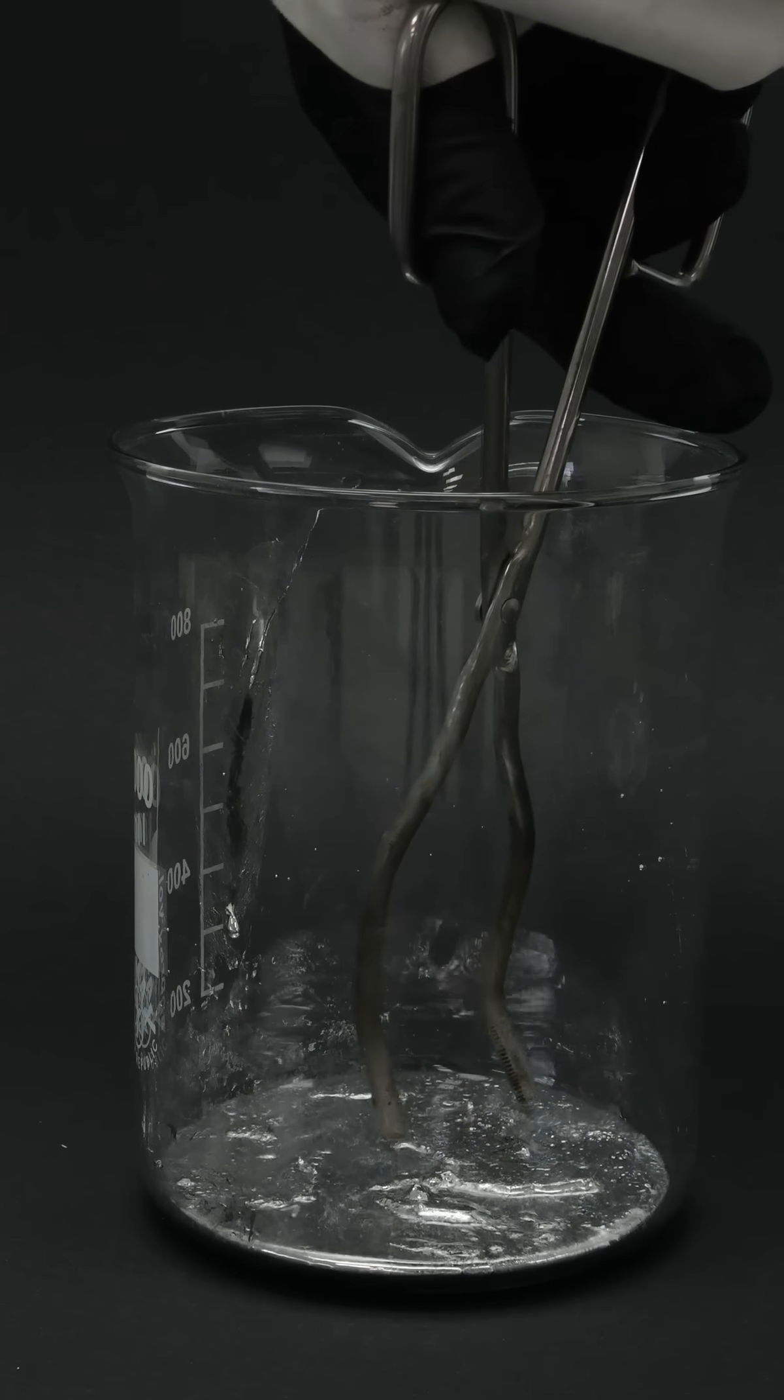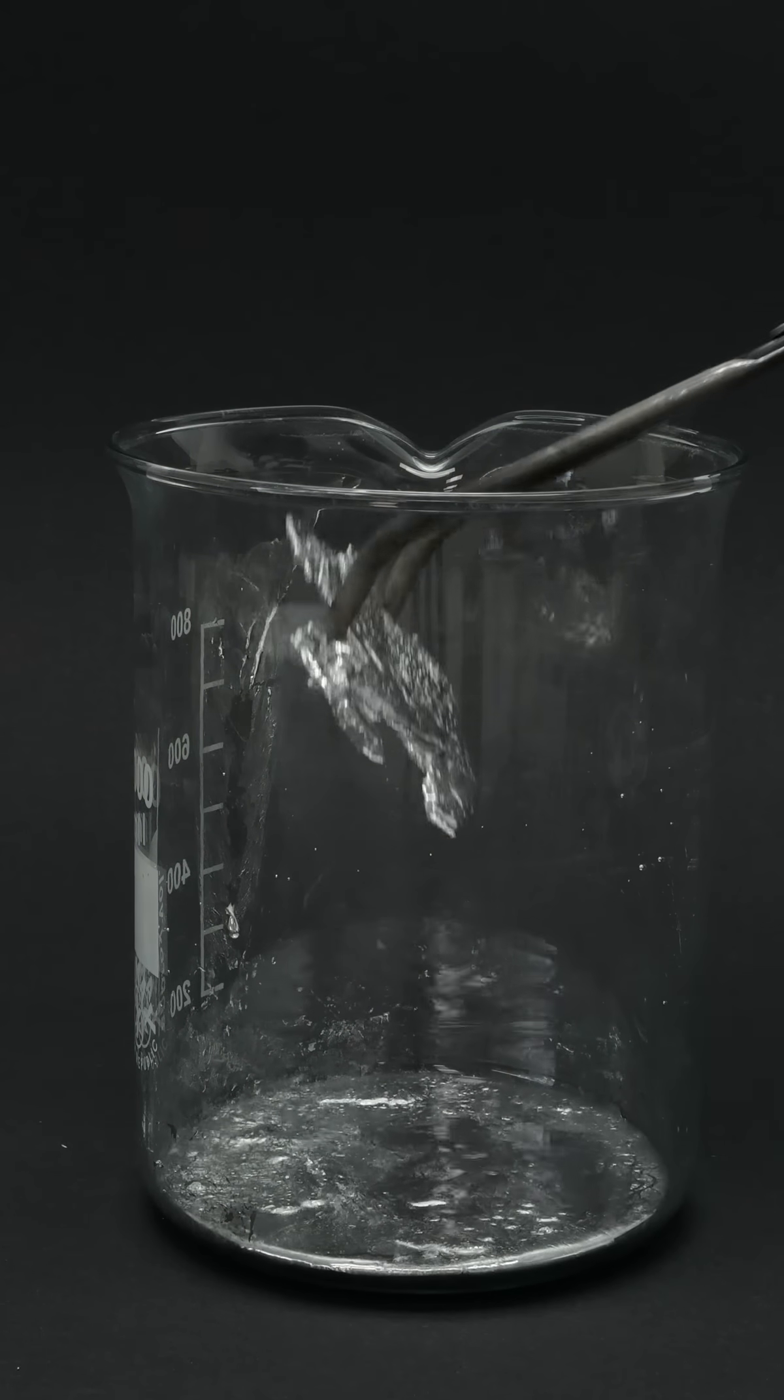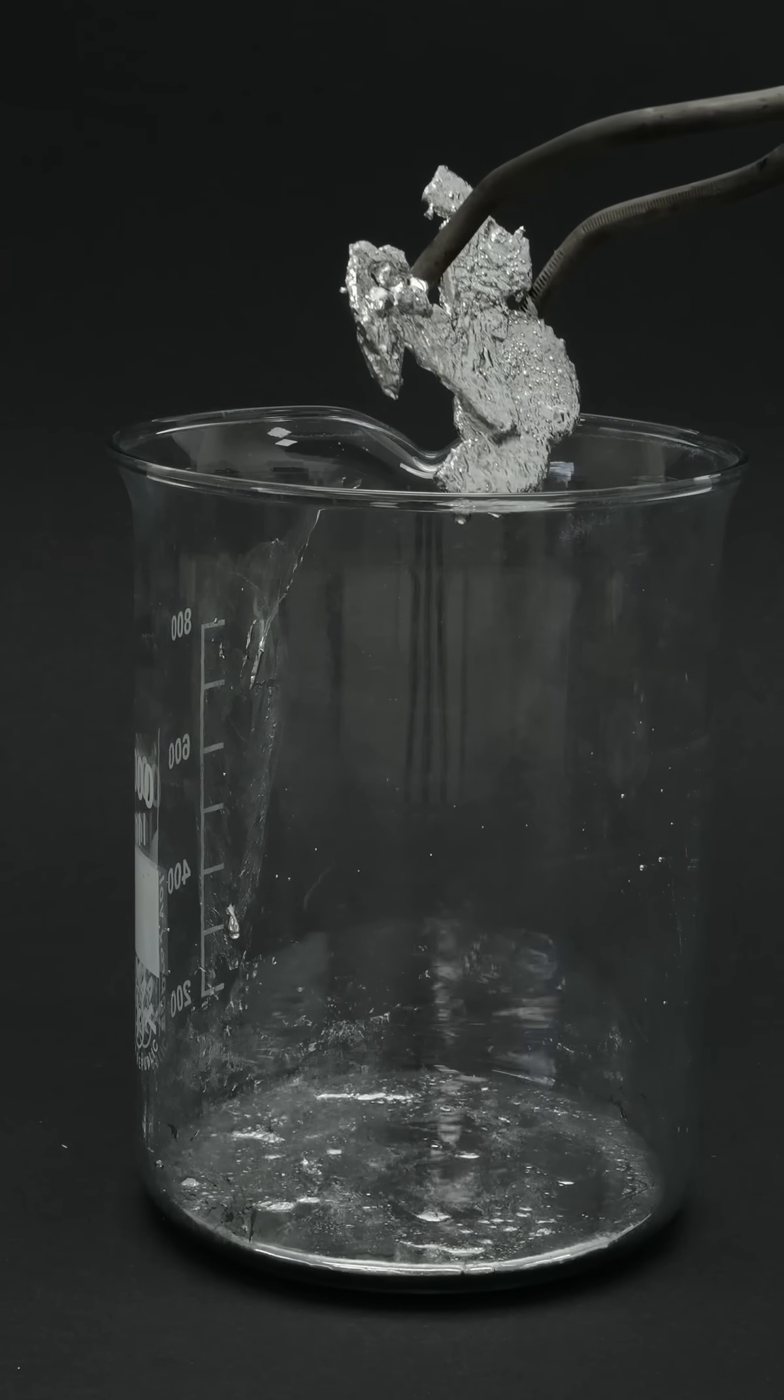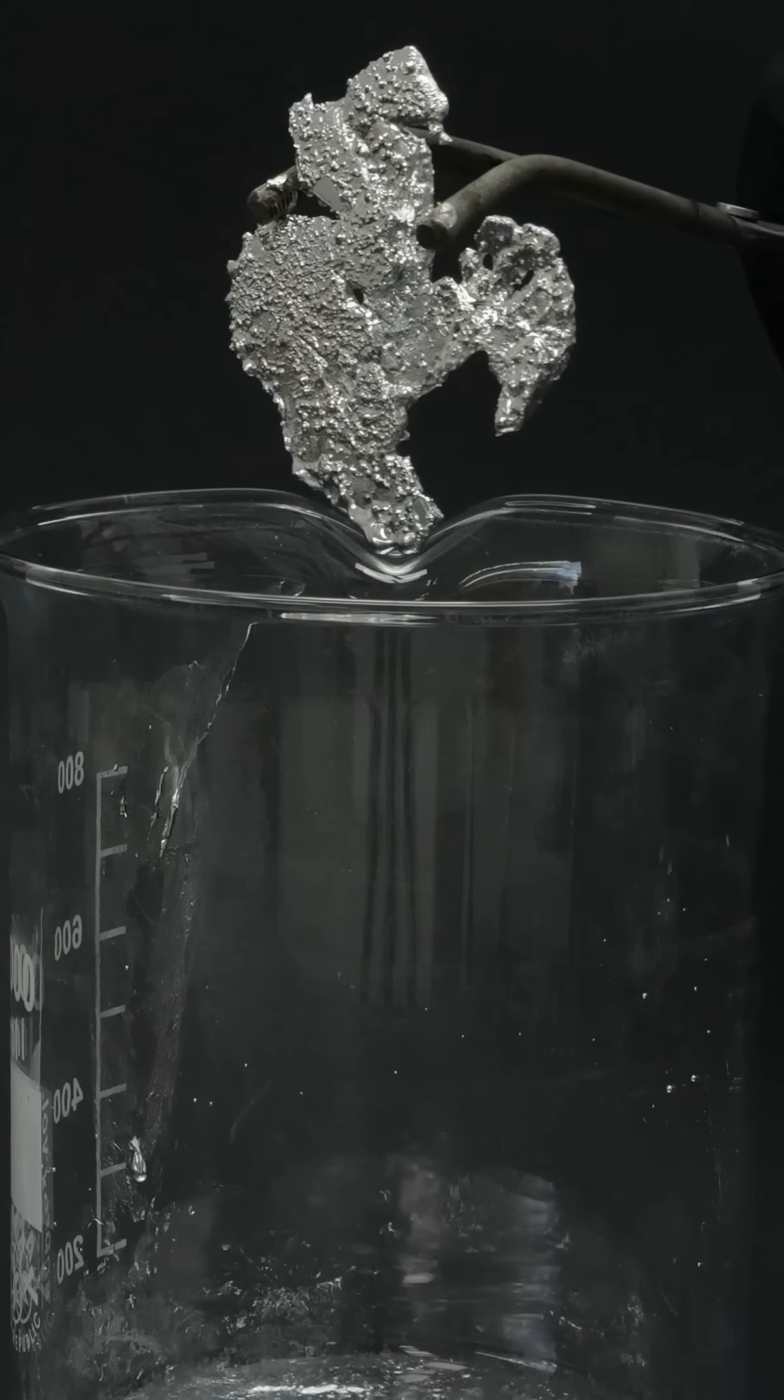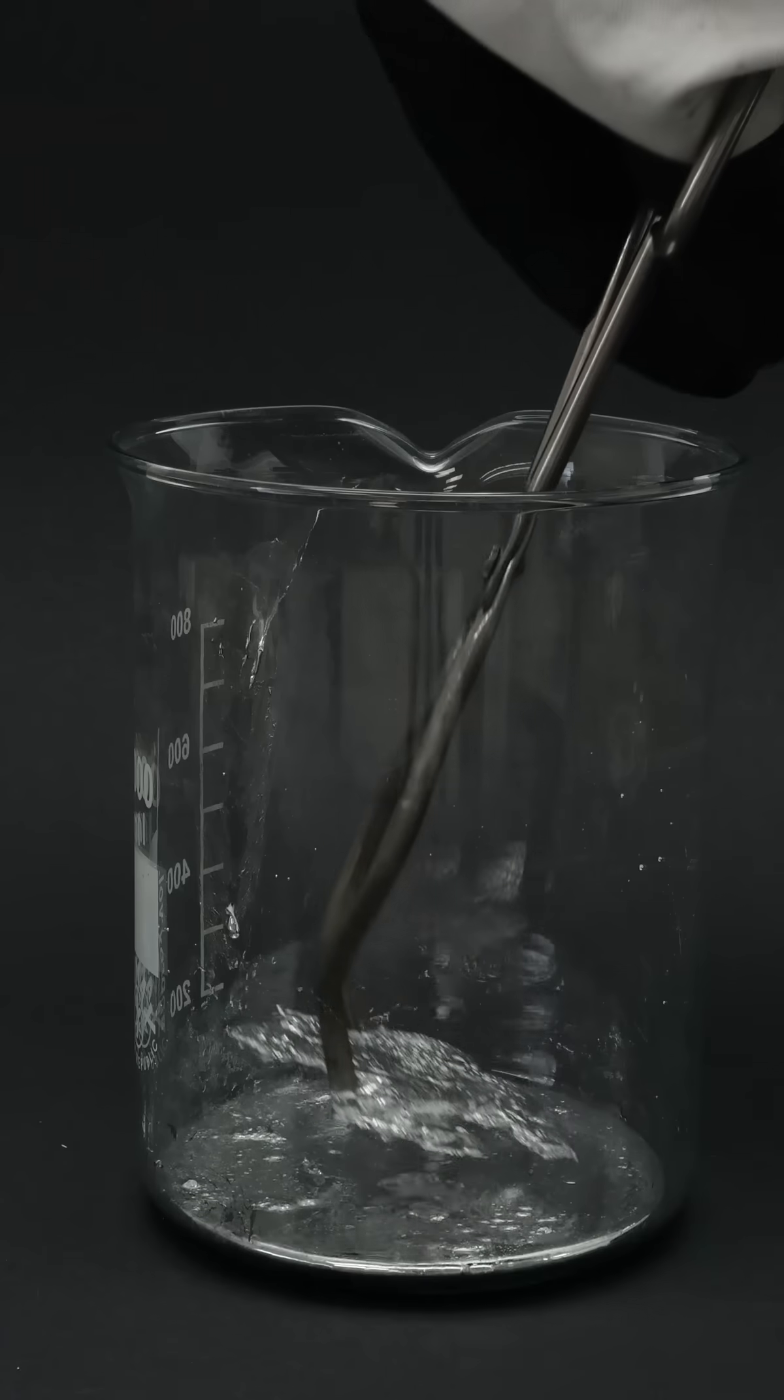When pouring it into a beaker, it's noticeable that part of the gallium has solidified again. That makes sense because the melting point of gallium is around 30 degrees Celsius and the lab is significantly colder.